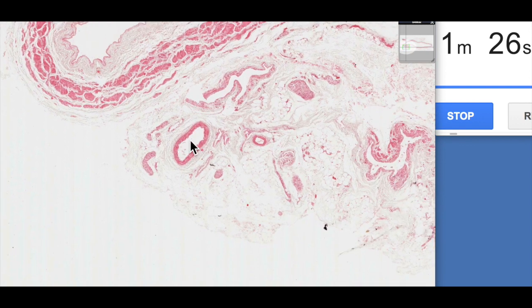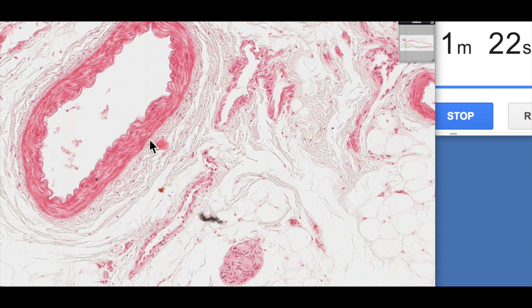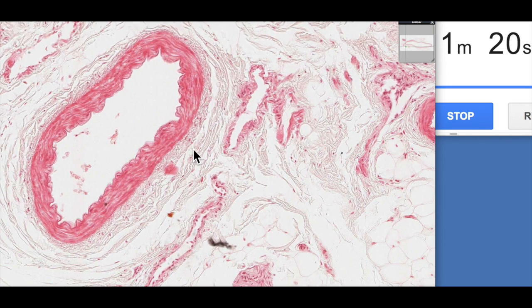What I found over here was this really nice evidence of a neurovascular bundle. If you might remember from a previous video where we looked at the muscular arteries, one of the characteristic features of a muscular artery that helps you to identify it is the waviness of the tunica intima.